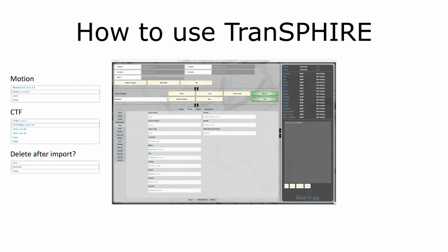After the data is imported, which means copied physically from the camera computer to the local machine, you can either delete the data or not delete it, or instead of actually copying the data, you just create a symlink, which is very useful for the just stack option.